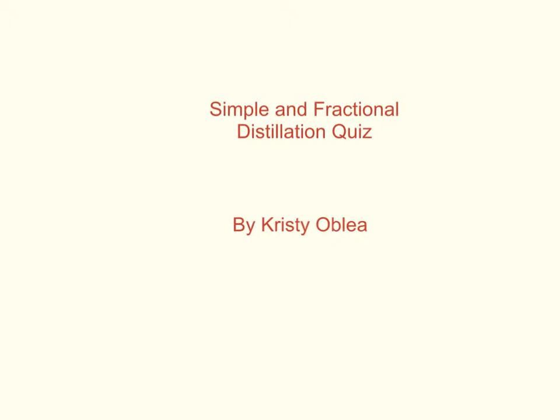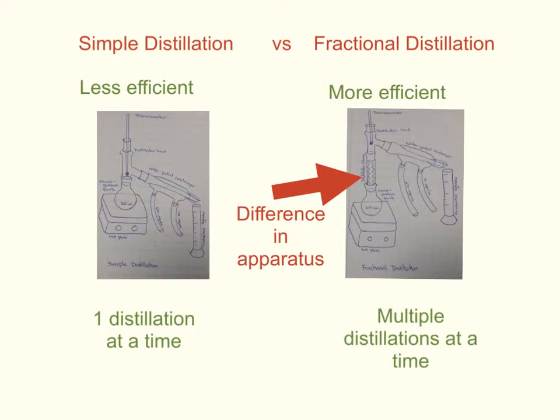Simple and Fractional Distillation Quiz by Christy Oblea. I'll be talking about the differences between simple and fractional distillation.